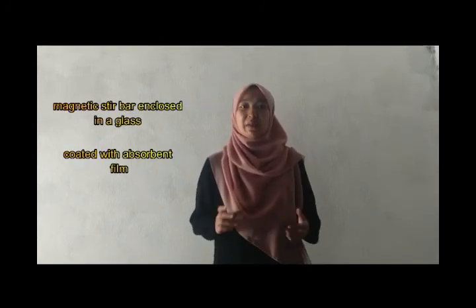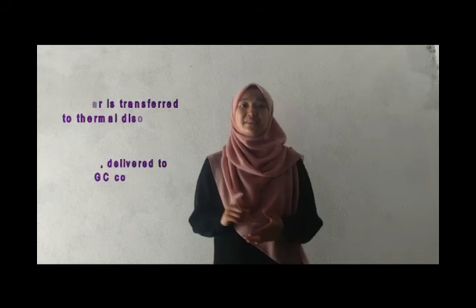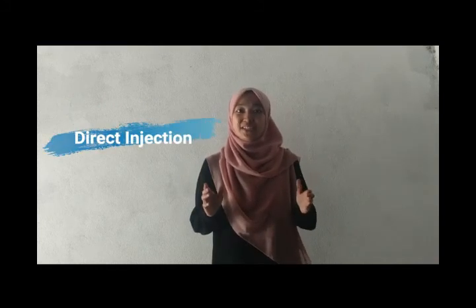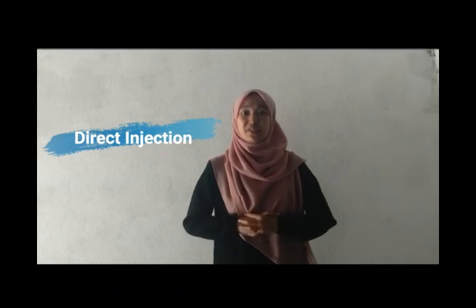For stir-bar sorptive extraction, a magnetic stir bar is enclosed in glass coated with an absorbent film. The bar spins in the sample and absorbs analytes, and then the stir bar is transferred to thermal desorption and delivered to the GC column. Last one is direct injection. For direct injection, we just inject 2 to 3 microliters of the sample directly into the GC column.